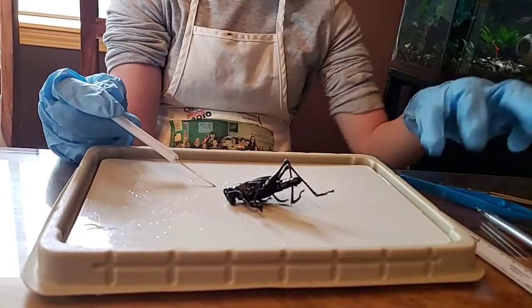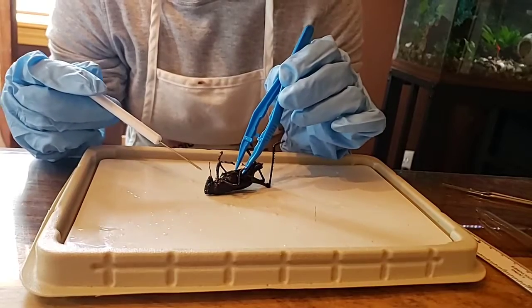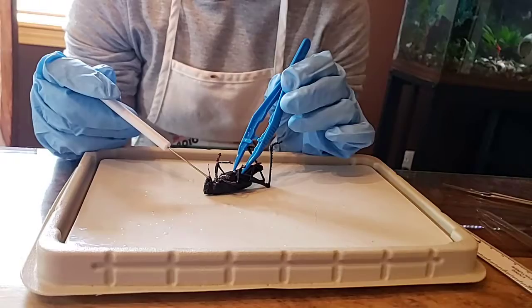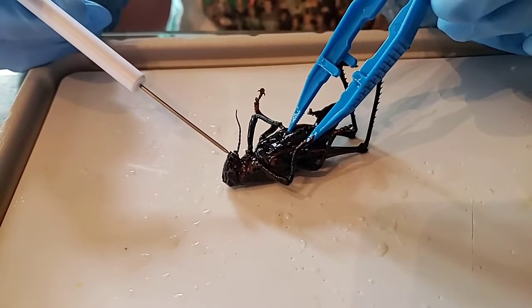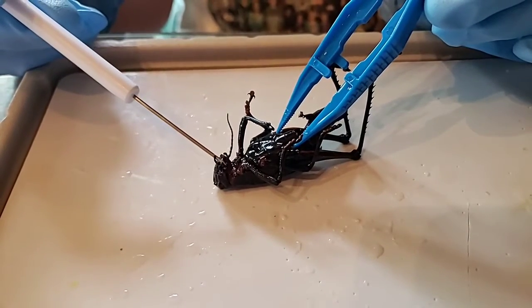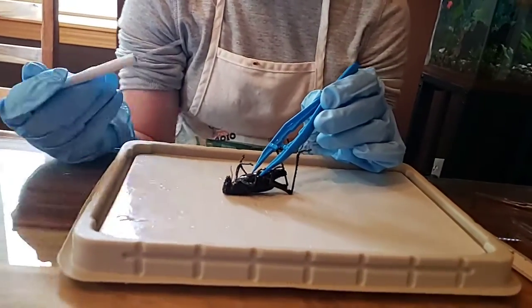So turn your grasshopper over. Let's look at the mouth where you can see both the mandibles, which are like claws or like teeth kind of things, and 2 pairs of maxillae right there. Can you see them? 1, 2. There's this one here, and then there's this one over here, and then there's another one there. Okay, so you got 2 maxillae, and then you've got 2 appendages. Perfect.